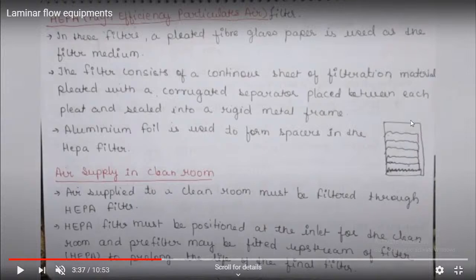In the diagram of the HEPA filter, it is prepared from fiberglass paper with the filtration material, corrugated with separators, a rigid metal frame, and aluminum foil as spacers.